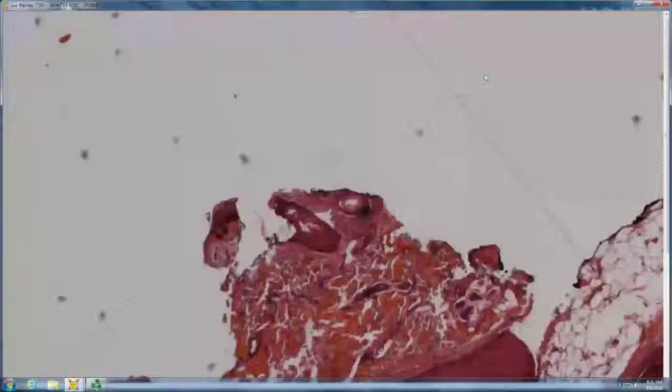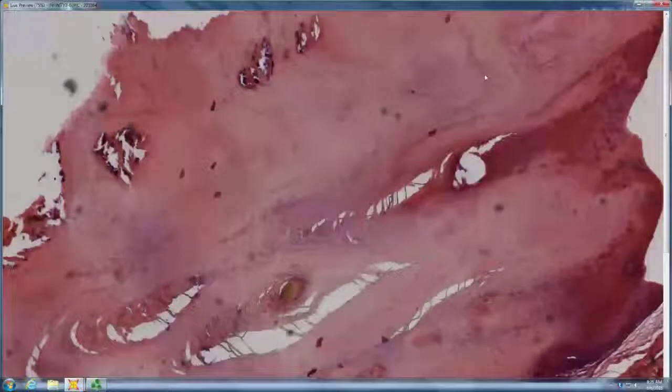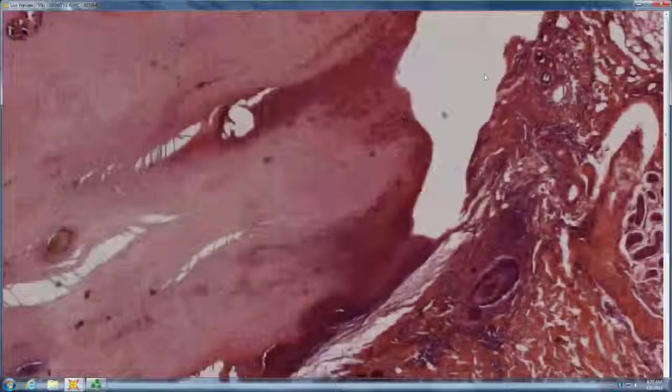So if you saw this on a patient, what would you call it? Hyperkeratosis. Yeah, massive hyperkeratosis forming a column. So it's a cutaneous horn, right? And what is the keratinization in this horn?